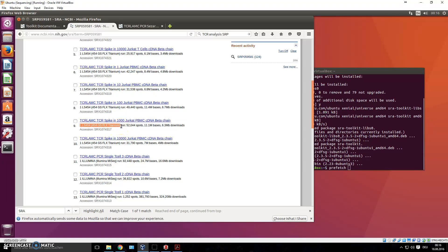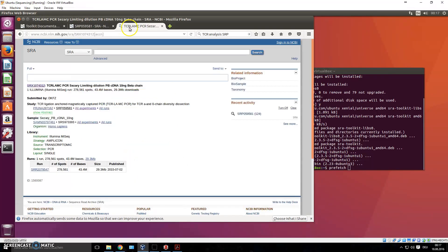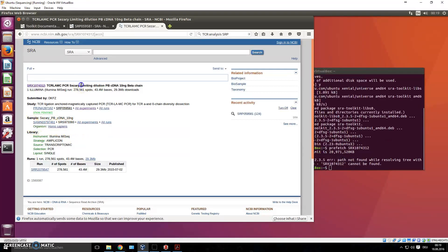For example, one sample was sequenced with the 454 GS FLX Titanium machine, which is dying out. I prefer something more current, like the Illumina MiSeq. I choose one sample, open it up, and here you have the different information about this sample: the sample name, the organism, and different accession numbers. What we're interested in is the SRR number — I just copy that.